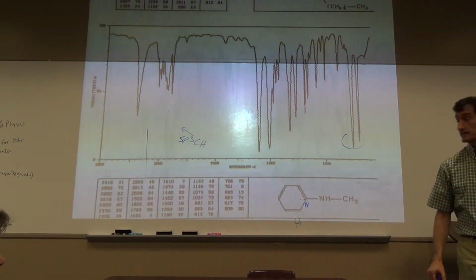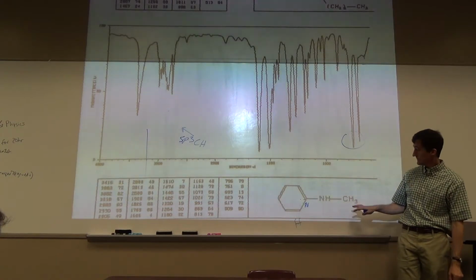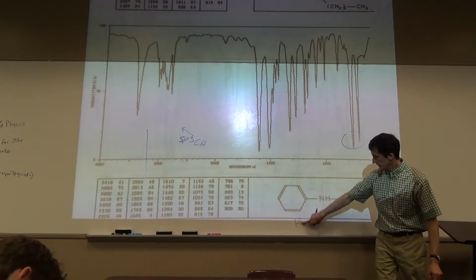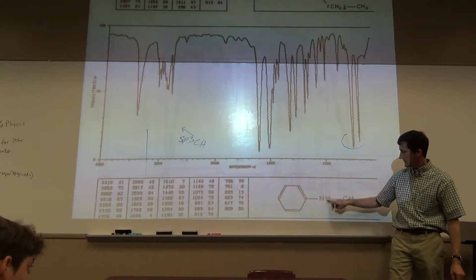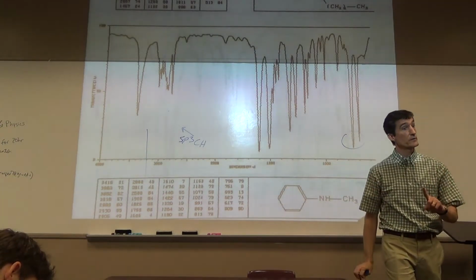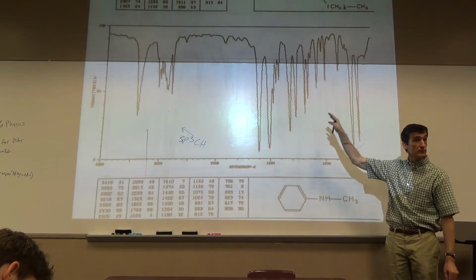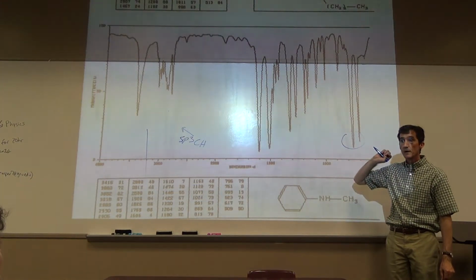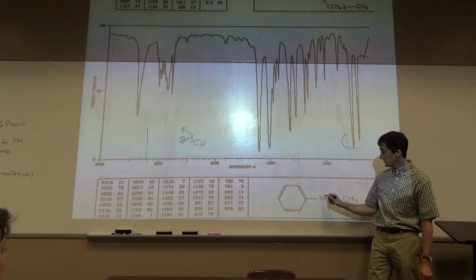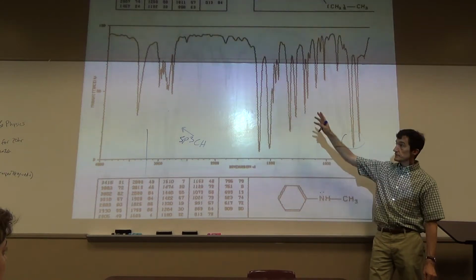Aniline. Happens to be an aniline. The name of this is N-methylaniline. Okay? And nitrogen is sp2 hybridization, right? It really didn't affect anything here. There's one NH, see the NH? I can talk about this though today. You see how that NH is stronger than the previous ones? If the nitrogen is conjugated, and what we're really talking about is the lone pair, if the lone pair is conjugated, the NH typically is stronger.